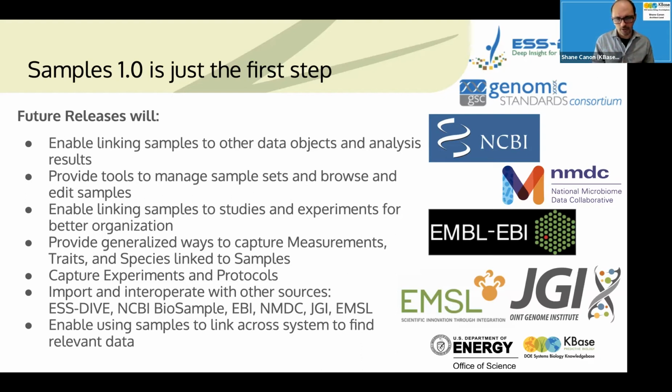We have support for importing, like I said, CSAR and some custom templates today, but we want to expand that and be able to interoperate and import directly from other sources. So for example, we're currently working on what it would take to import from BioSample. And then eventually all of this is around being able to link data across the system.